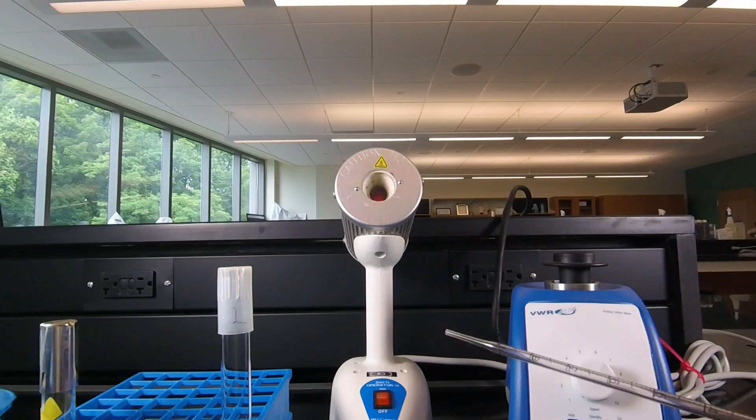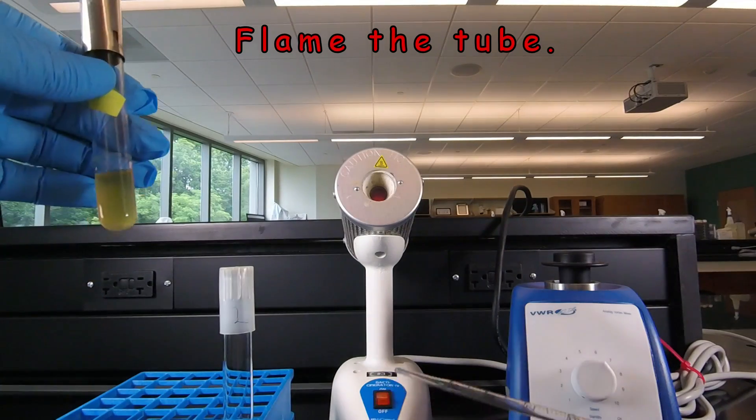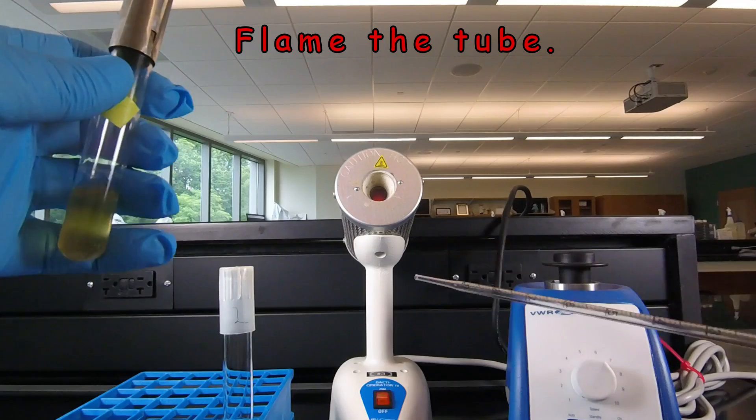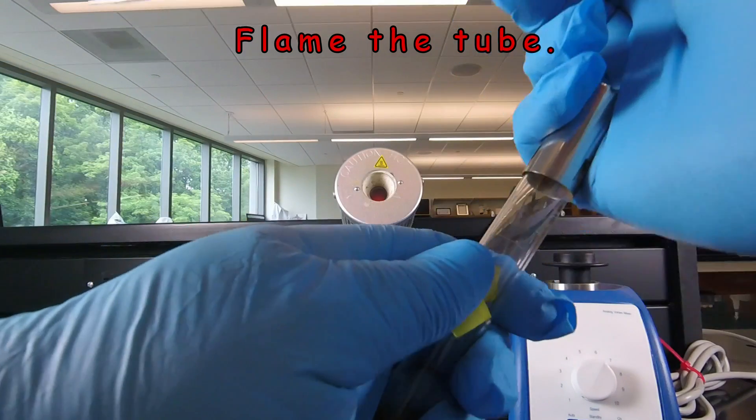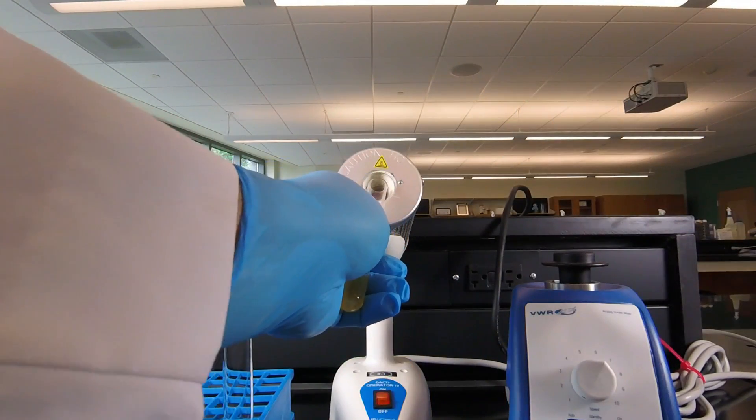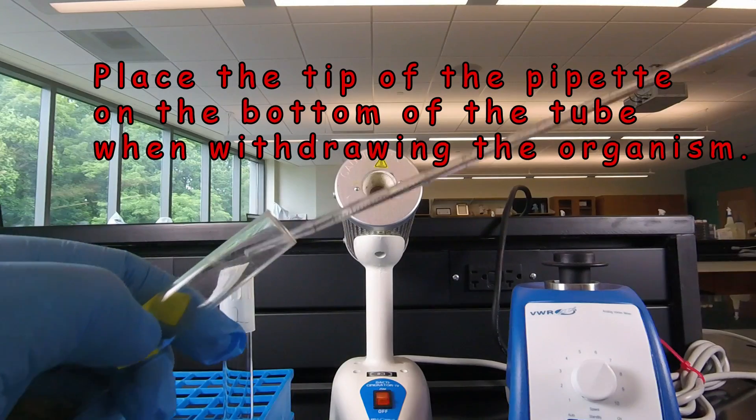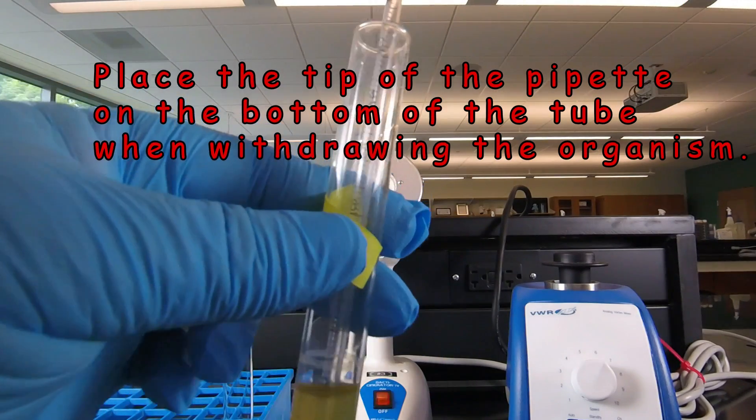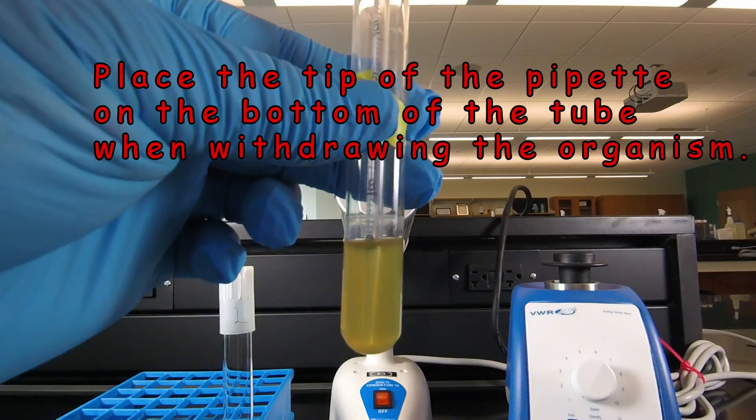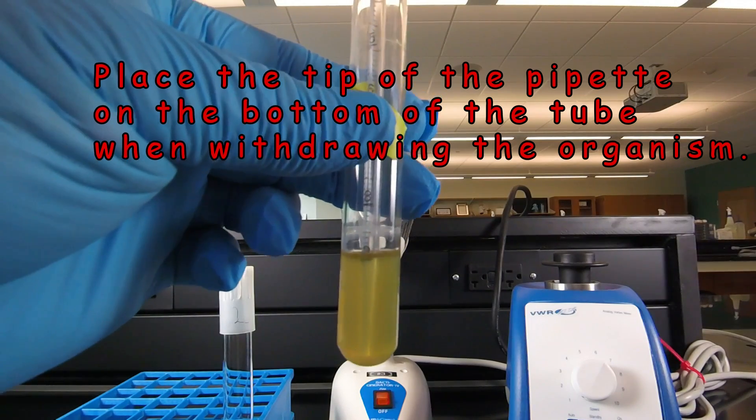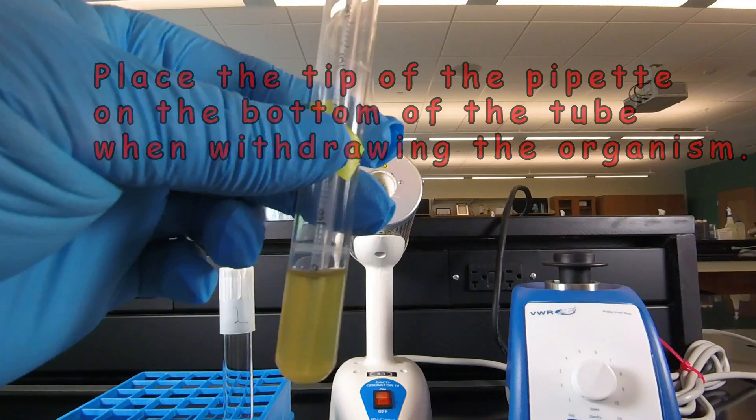So what we're going to do to start out then is remove some bacteria. And so again in aseptic technique we would flame the tube. Then we're going to put the pipet all the way into the bottom. Now again when we're pipetting we want to make sure we don't suck up air, just the liquid. So we want to make sure the pipet goes all the way to the bottom.